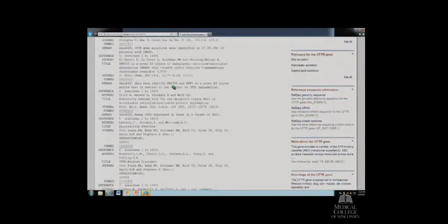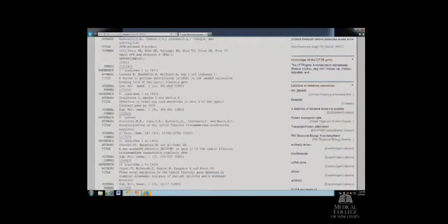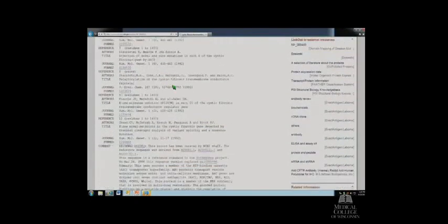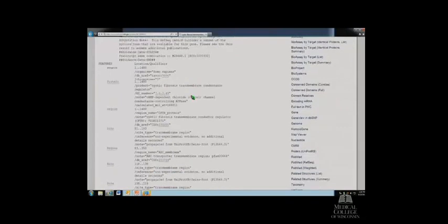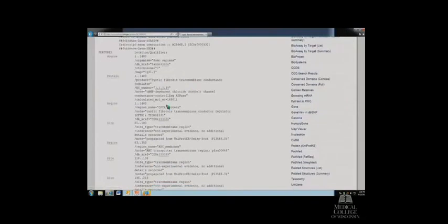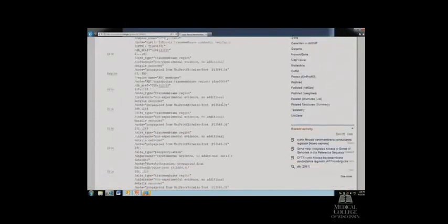This is a RefSeq, so again, this record is annotated. It's got a lot of information associated with it, including this comment from the annotators. But as we scroll below that, then we start to get to all the protein information, its location, the sites along the protein.